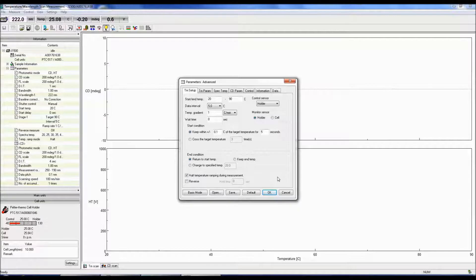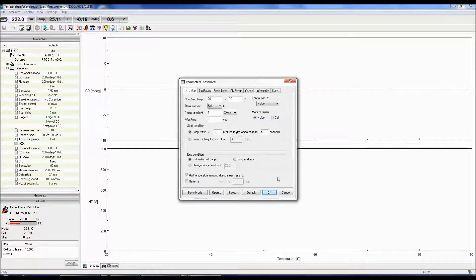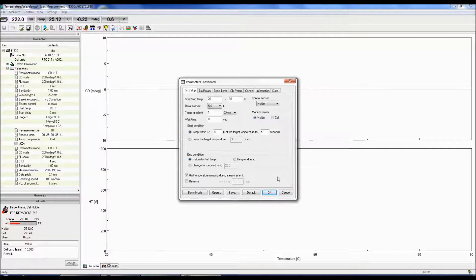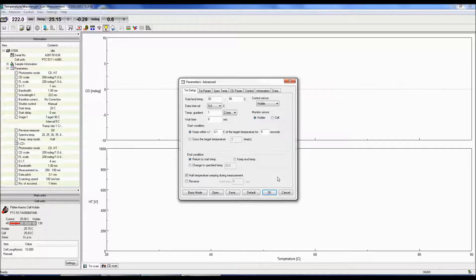Selecting Halt Temperature Ramping will stop the temperature change during the measurement. Selecting Reverse performs a reverse measurement after an increasing temperature measurement. The hold time is the amount of time before the reverse measurement begins.